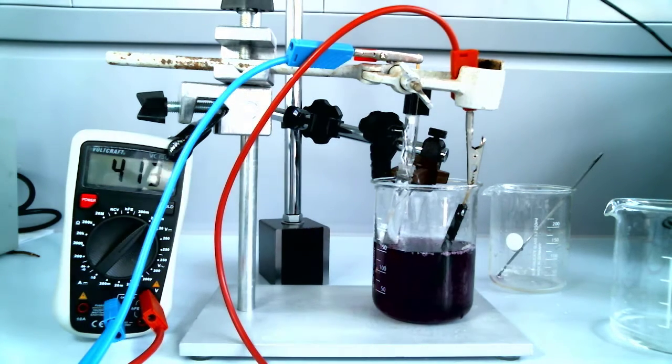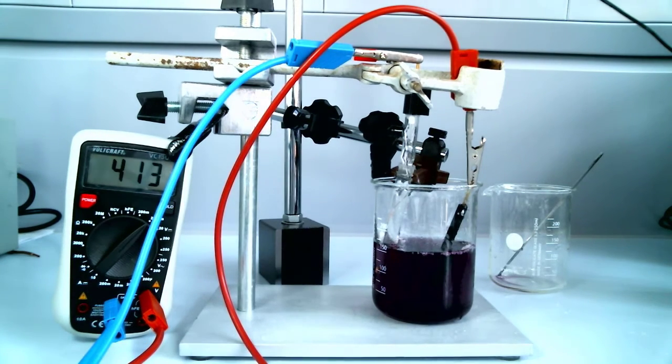It's still recording. What we can see is that the color is incredibly deep. We had a very light sort of urine-y color beforehand, and now we've got nearly black. It's deep purple, really. The color of the complex is caused by charge transfer between the salicylate ion and the iron in the center, and it makes a very large effective orbital which absorbs a lot of energy, and the iron electrons can jump up and down. Some of them can get onto the ligand.